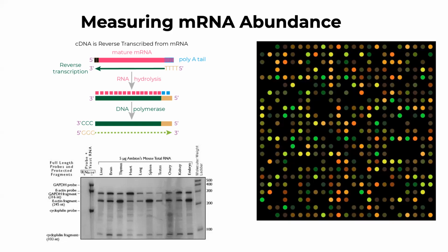These technologies allow us to focus on one known or a number of different known genes, transcripts, exons, or fragments. What it doesn't allow us to do is discover novel RNA, right? And because of this process of exon rearrangement, exon skipping, and what's called alternative splicing, we are limited as to how many actual probes we can put on a panel, as you see right here.